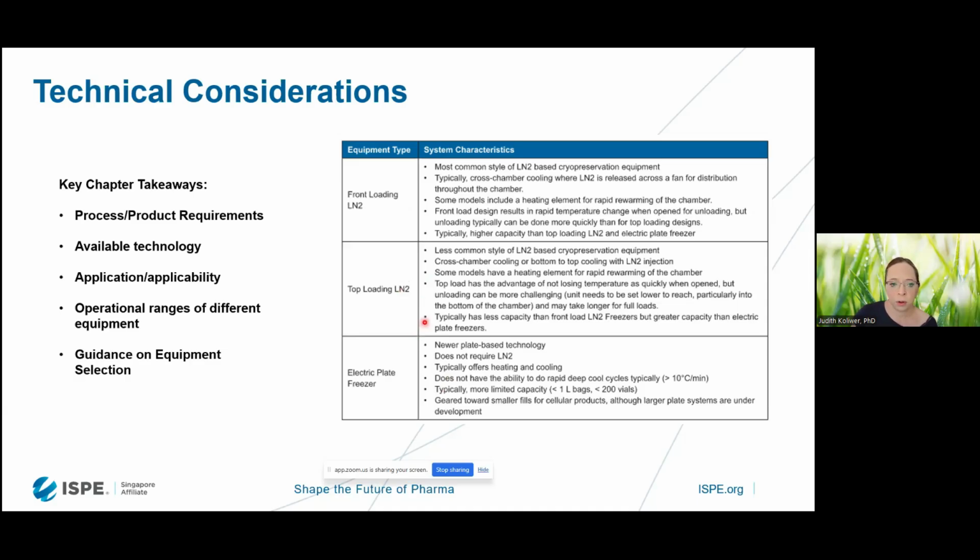At the same time, of course, there are also aspects that really speak for the liquid nitrogen tank, but we need to find the balance between how much risk do we want to take, particularly in this feeding protocol of our liquid nitrogen into the tank.